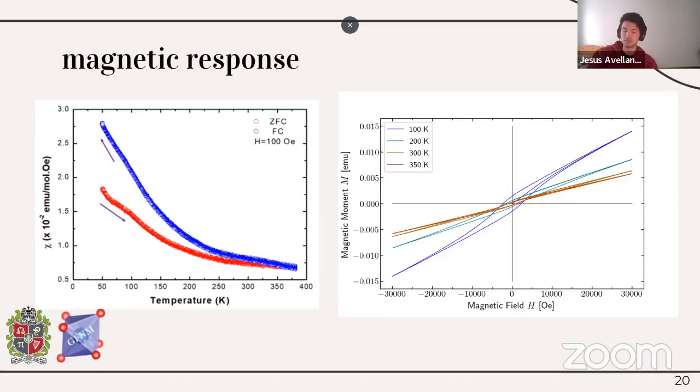For the magnetic response, as I said, the data was obtained from the VSM. The first analysis that interests us was the magnetic moment against the temperature. That is the graph that you can see right here. Basically, if this graph showed reversible paramagnetic behavior, then there's nothing to do, and we should proceed to study other things. I'm not saying this because we have something against paramagnetic materials, but as we stated previously, we want to have a ferromagnetic behavior. So if we had obtained paramagnetic curves, it was not worth it to start measuring isothermal curves.